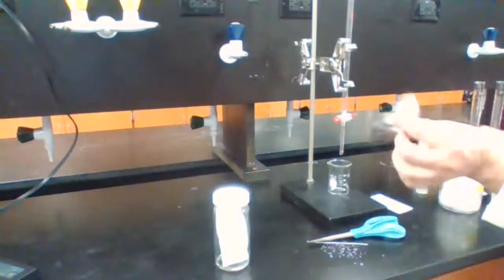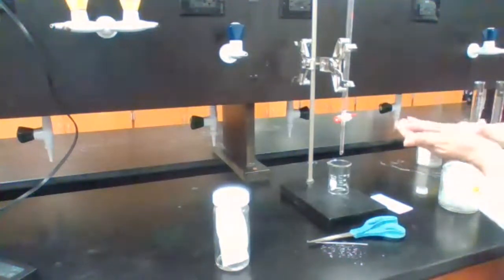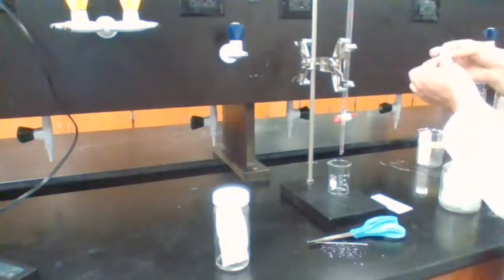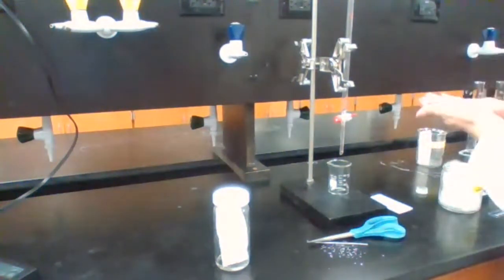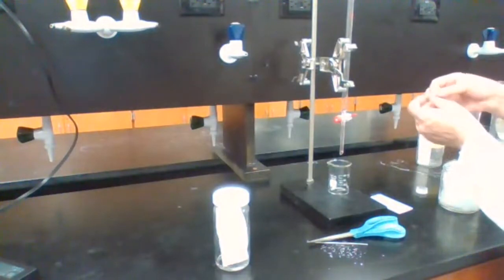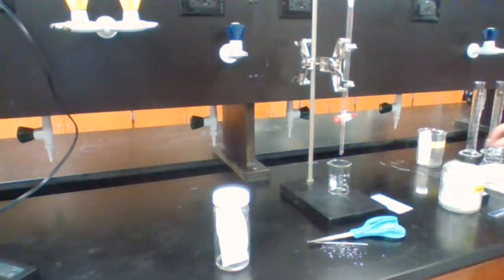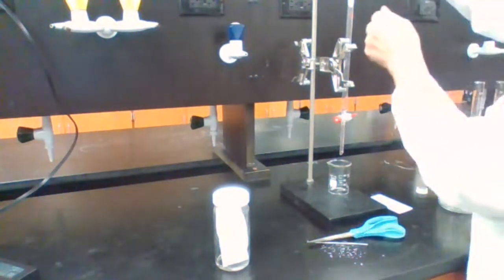Take a small piece of glass wool and place it inside the column. It doesn't have to be that big. See if this one works to push it down.